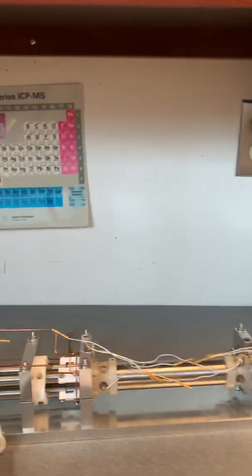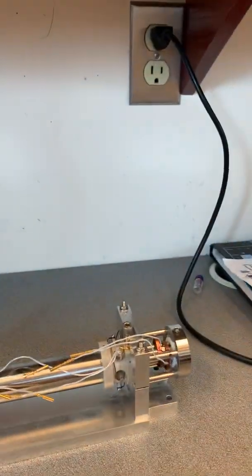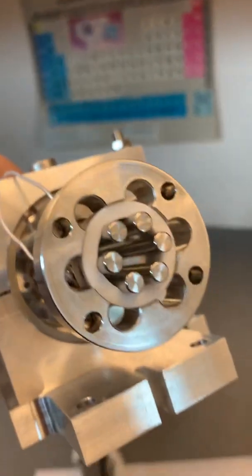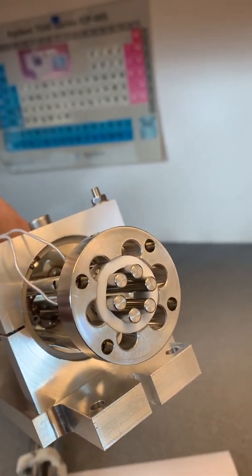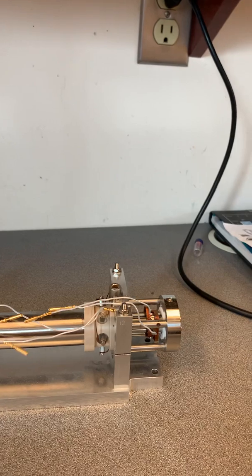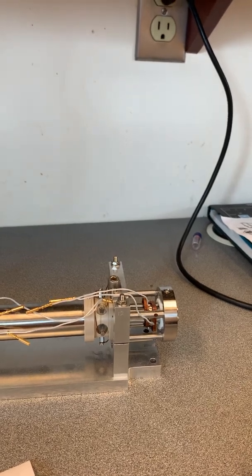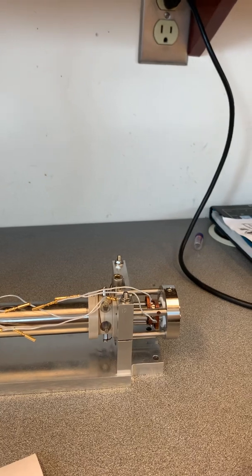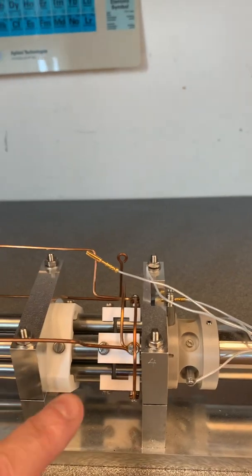Here is another quadrupole. There are three quadrupoles in a row, and at the beginning of this quadrupole we have a lens — this lens is actually a hexapole, so you can see there are six rods. Quadrupoles and rods are often used as focusing lenses; we need to focus the ions and send them down through the quadrupoles, so often you'll have lenses like a hexapole to guide them. Then we have one quadrupole here, a collision cell, and then another quadrupole leading eventually to the detector.